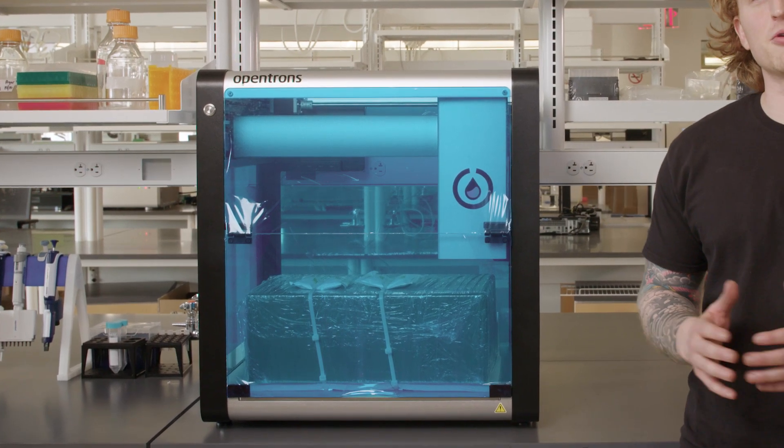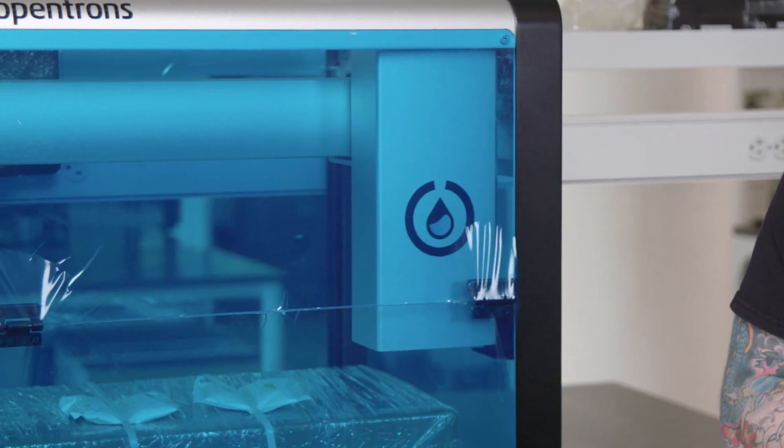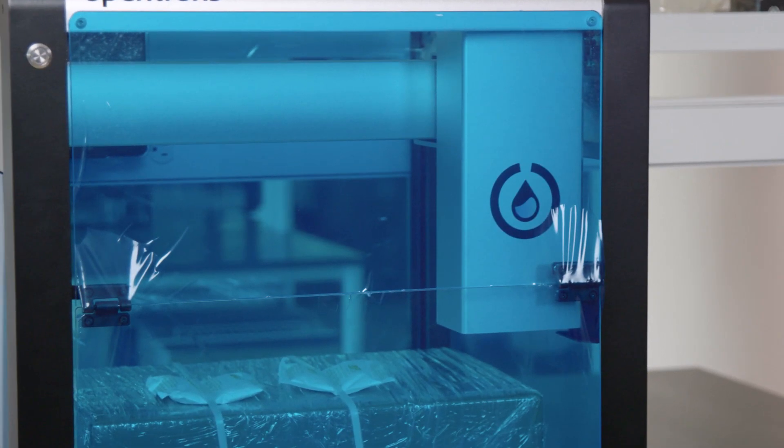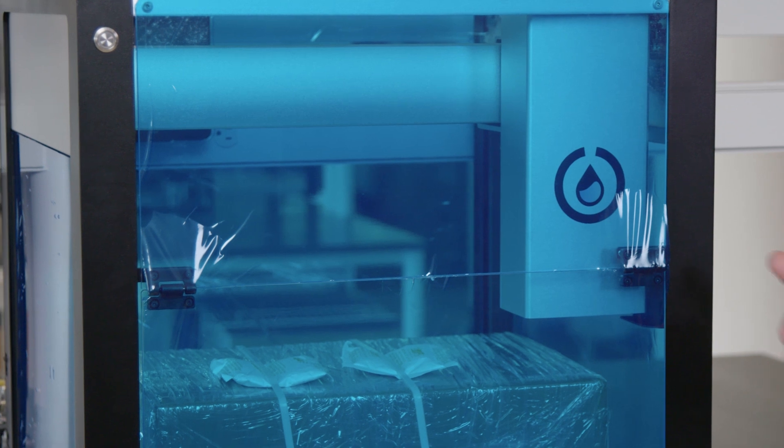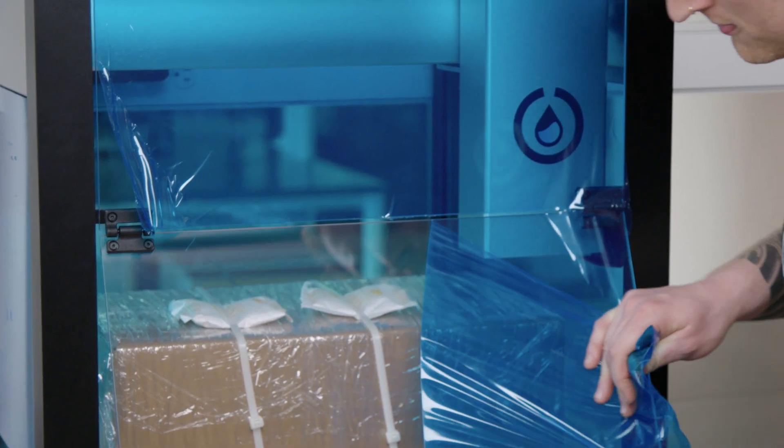As you can see, it fits perfectly on the table — it's a 60 centimeter aluminum and steel cube. There is some protective film covering the windows. I'm going to go ahead and remove that right now.